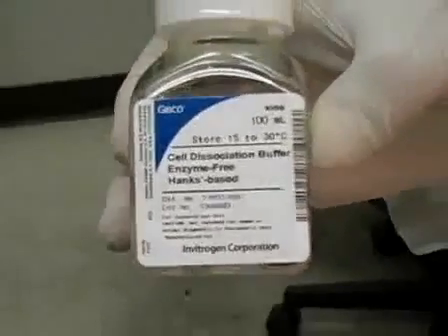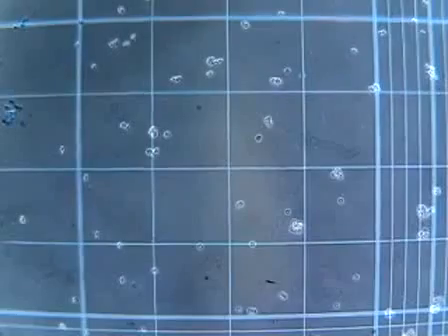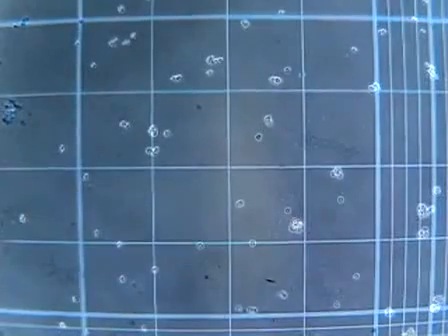First, I'm going to start by taking the cells off the surface using cell dissociation buffer and then counting them. For that procedure, refer to my passaging protocol.